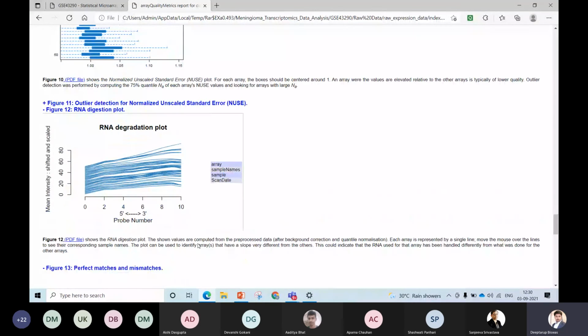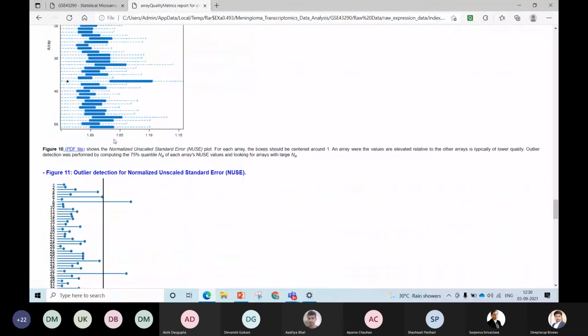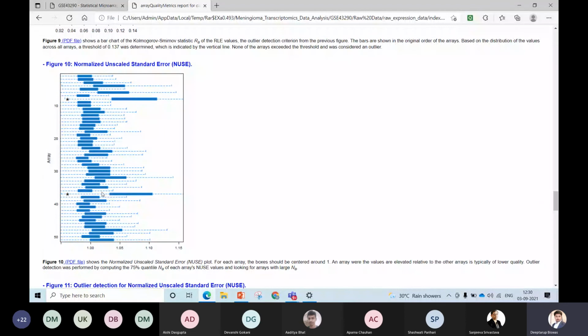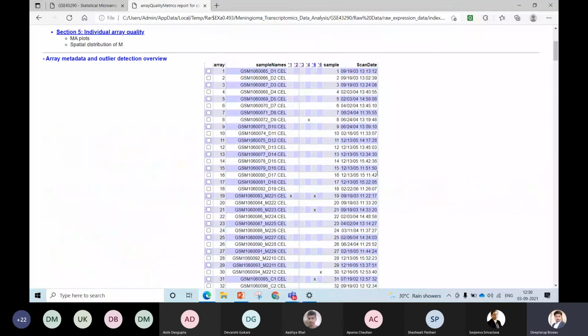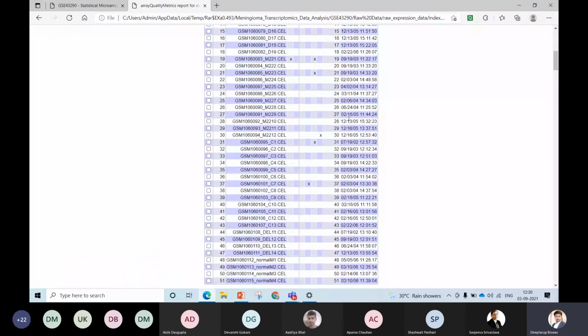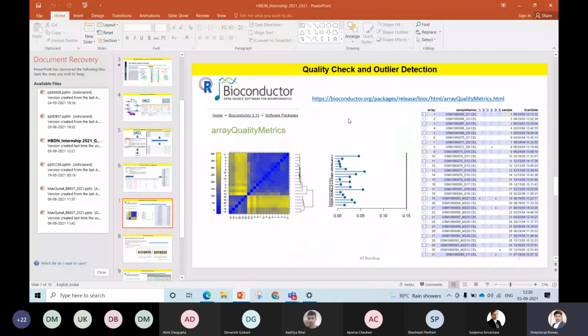So yeah, this one. See, there are 2 stars here. So this means these 2 are outlier data. Like this, we will look at this particular table and remove these samples, right? These samples which are coming up as outliers. This is very important, because only on that basis can we take the data forward.